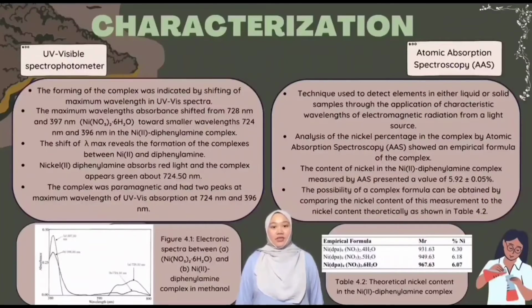Second, atomic absorption spectroscopy (AAS) is a technique used to detect elements in either liquid or solid samples through the application of a characteristic wavelength of electromagnetic radiation from a light source. Analysis of the nickel percentage in the complex by AAS shows an empirical formula of the complex. The content of nickel in the nickel 2 diphenylamine complex measured by AAS presented a value of 5.92 plus minus 0.05%. The possible complex formula can be obtained by comparing the nickel content of this measurement to the theoretical nickel content as shown in Table 4.2.